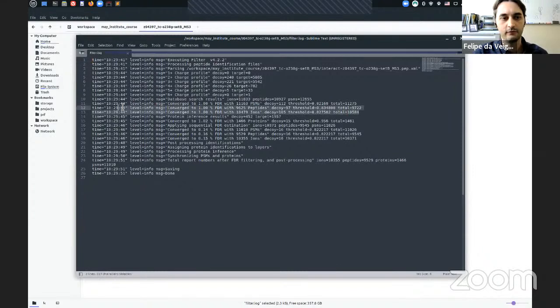We can see how they were broken down into these PSM, peptide, and ion layers, showing their individual FDR scoring, the number of proteins that were identified by the protein inference, and the current number of target proteins that were approved under here, in this case 1% FDR scoring.